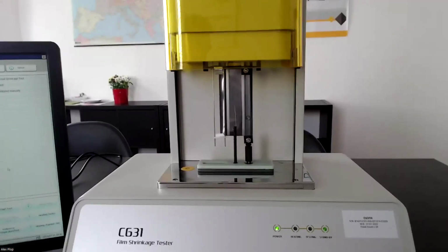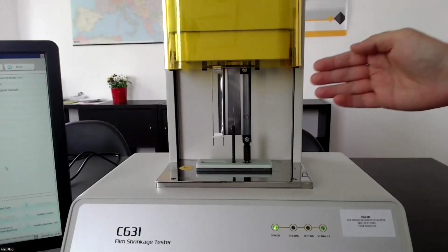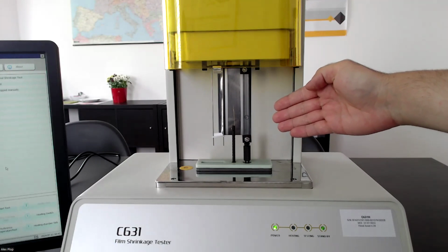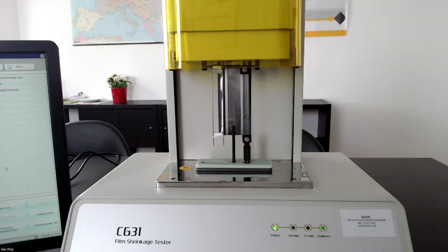So for the test to make complete sense, it would be the same type, but one with the load cell, so it's going to measure the force, and the other one with the infrared sensor is going to measure the shrinkage ratio. So it's the same type, but installed in two different sensors for two different data. Okay, then thank you.